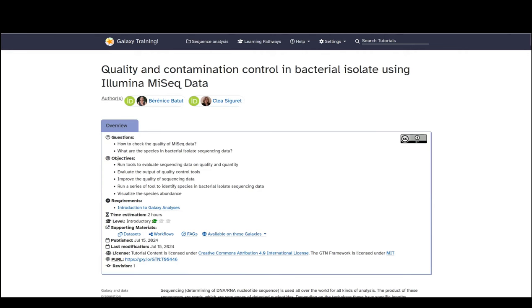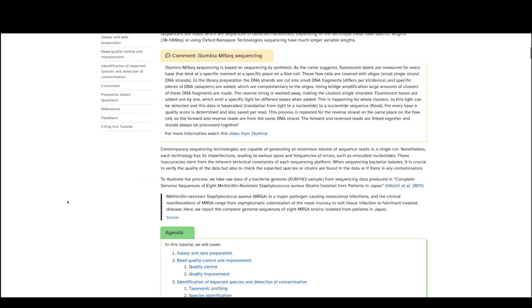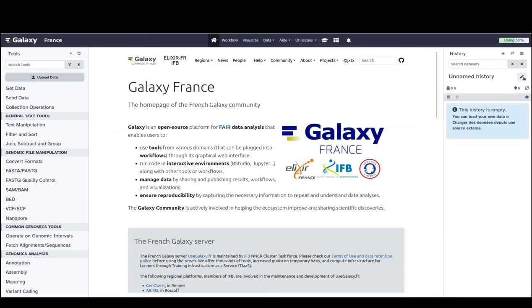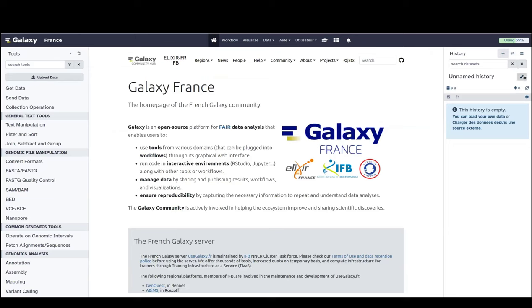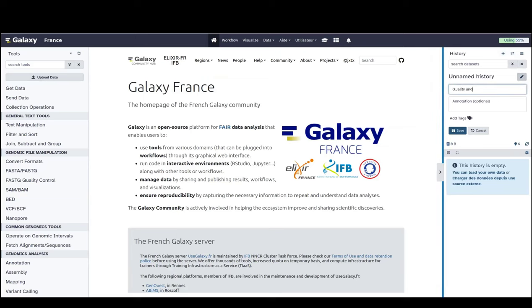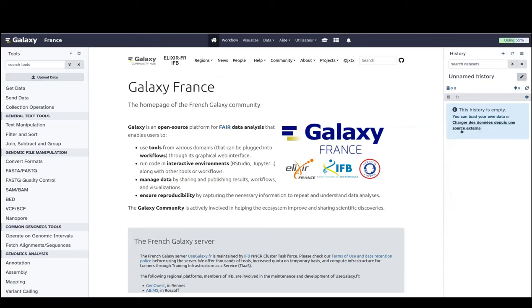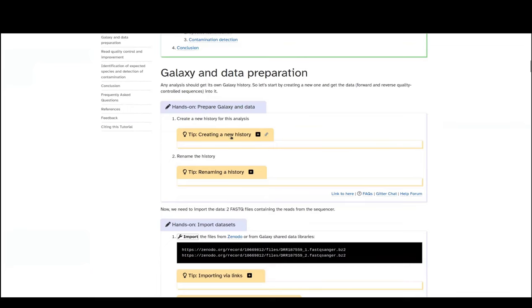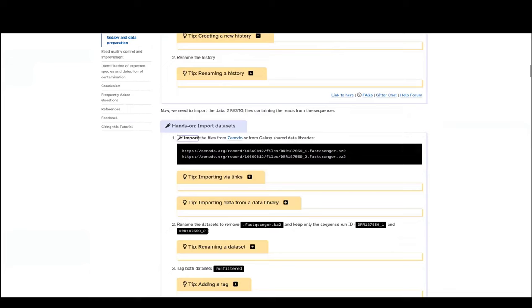The best way to get started is to create a new history if you haven't done it already. Create a new history — I will call mine 'quality and contamination control' — and you need to save it. Now we have our new history and we need to import some datasets.